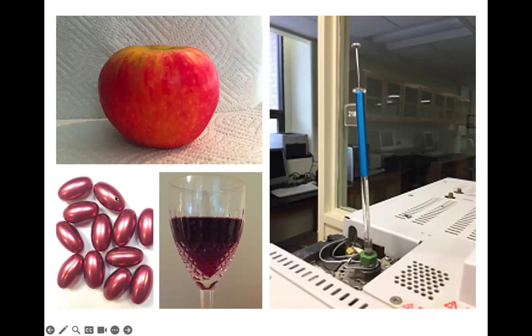So you cannot just straight away dump these coffee beans into the machines, okay? So you have decided to use HPLC to analyze the caffeine in the coffee beans. So you have to do some sample preparation. So you might have to crush them, to sieve them, okay? But the most important part is to get the caffeine out from the coffee bean, okay? How do we get the caffeine out from the coffee bean?